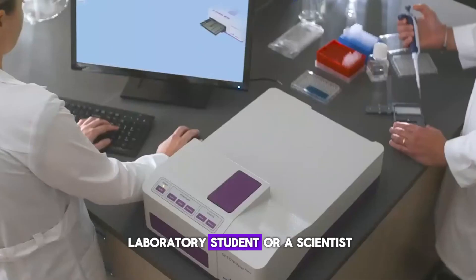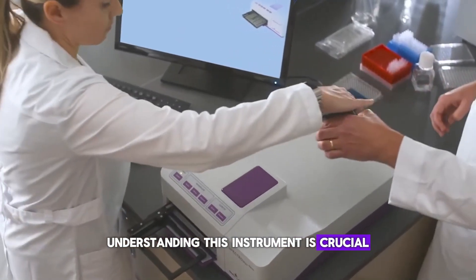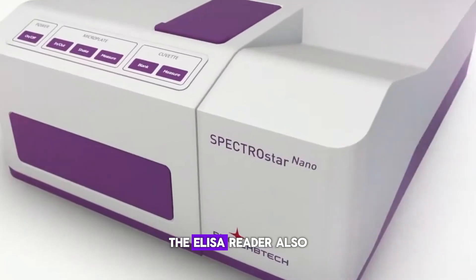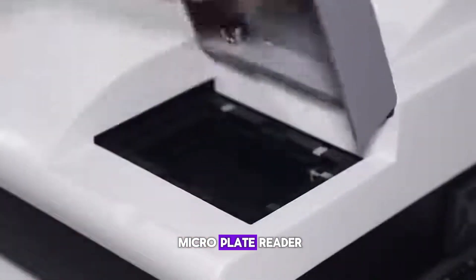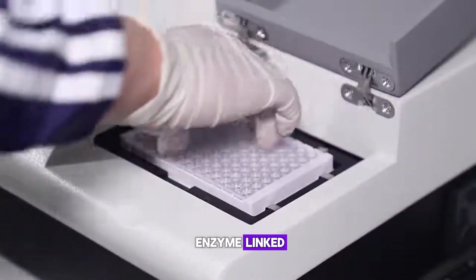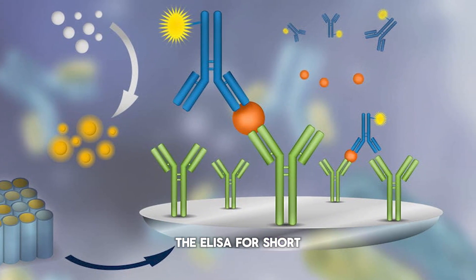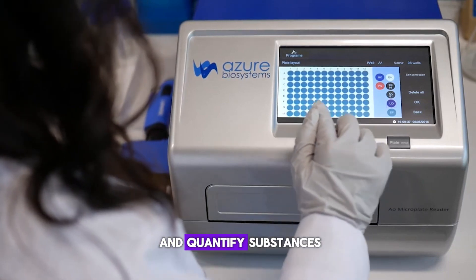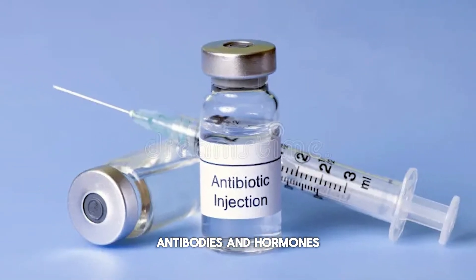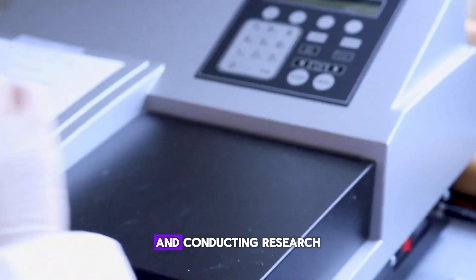If you're a medical laboratory student or a scientist, understanding this instrument is crucial for your work in immunology and diagnostics. The ELISA reader, also known as a microplate reader, is a device used to measure the results of an enzyme-linked immunosorbent assay, or ELISA for short. This machine allows us to detect and quantify substances like proteins, antibodies, and hormones, making it essential for diagnosing diseases and conducting research.